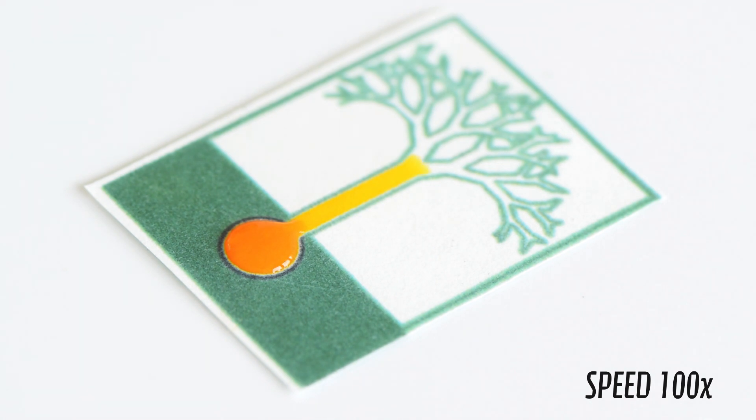In the paper sheet, we can have all the geometry that we want, all the patterns that we want to guide the liquid in the form of the paper sheet. The property of the paper is that we can also fold it to have a device made of several layers of paper. For this, I can create a pattern, like this one, composed of several layers. So it's always the same, it's the wax, everything in black, and the paper, which is available for the liquid.